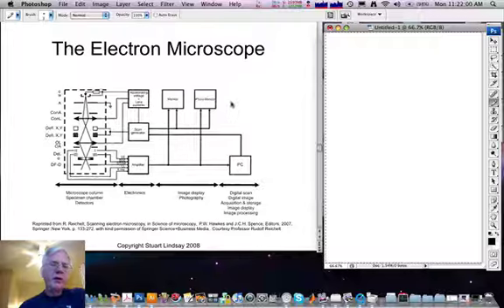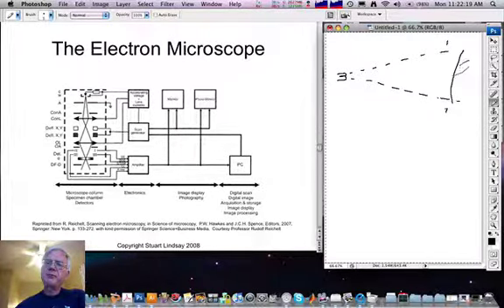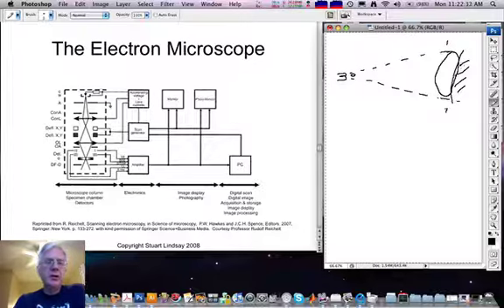The half-micron wavelength of optical light limits the resolution of an optical microscope. To overcome this, in the 1930s, Ernst Ruska proposed a microscope in which electrons were accelerated from a small source towards a phosphorescent screen, so that an object placed in the path of the source close to it would cast a magnified shadow image, the magnification of which could be arbitrarily large because electrons are particles.